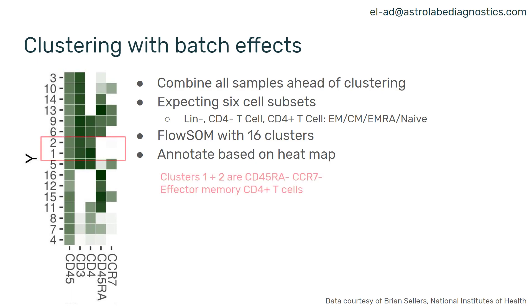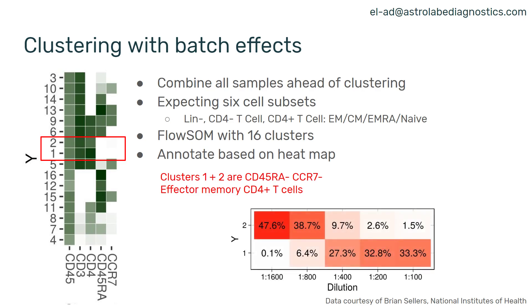We can see two clusters that have a signature of effector memory CD4 T-cells — they're negative for CD45RA and CCR7. The question is: why do we have two clusters? In a real study, a common question would be whether this is a biological effect or something novel. However, when we look at the distribution of the different samples across these clusters, we see a very clear effect: cluster one has the least diluted samples, while cluster two has the two most diluted samples. Since this is a toy dataset and we know the batch effect coming in, we can clearly identify it, but this is a real concern in actual experiments.